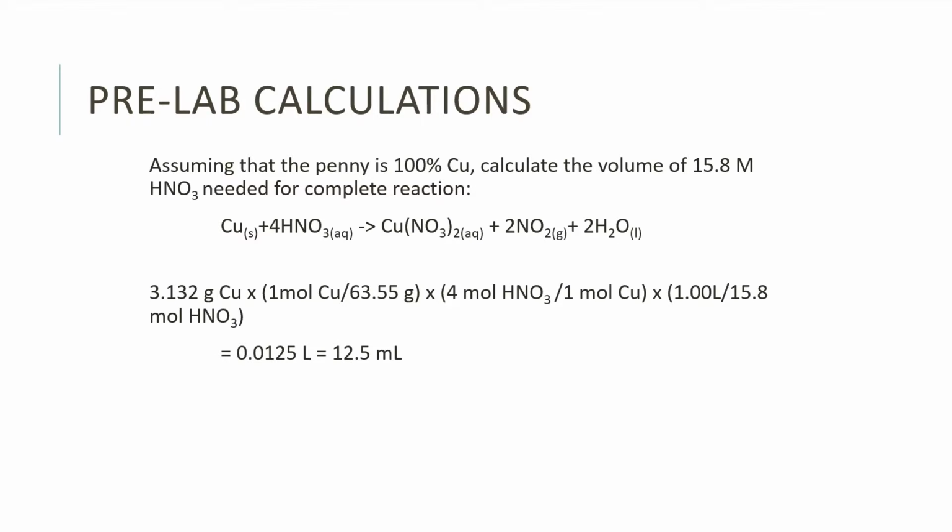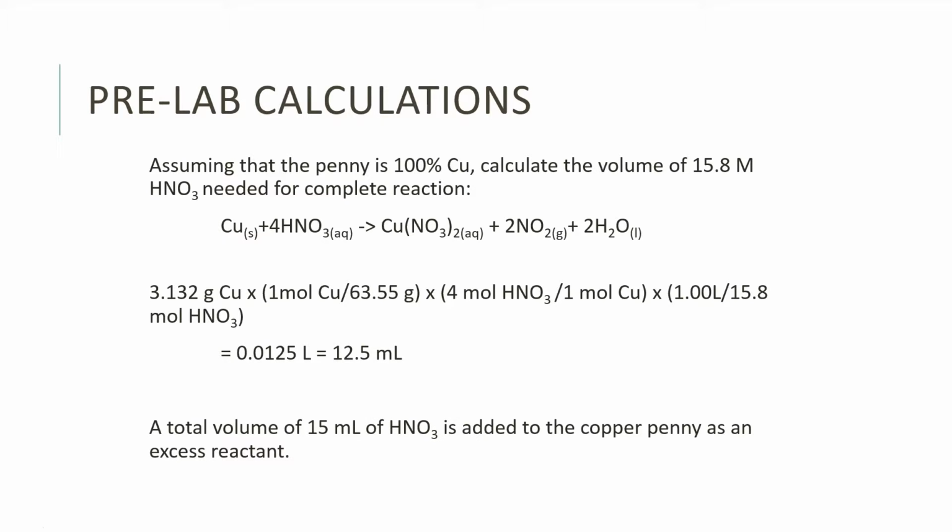Even though you already assumed the penny is 100% copper, you should still add a few more milliliters of acid to be 100% certain that the penny completely reacts. So, in this case, you would add 15 milliliters.